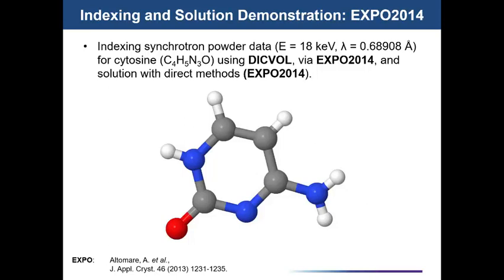Now I'm going to zoom in on our region here to see what peaks are missing. If I go back to Pattern and Peaks, I can add or delete individual peaks in here. So I'm going to choose Add Delete Peaks. And I'm going to add, there's pretty clearly a peak missing right about here. And there's a little one missing right here. And that's looking pretty good. Now we've got more than 20 peaks. So what we can now try to do is index the pattern.